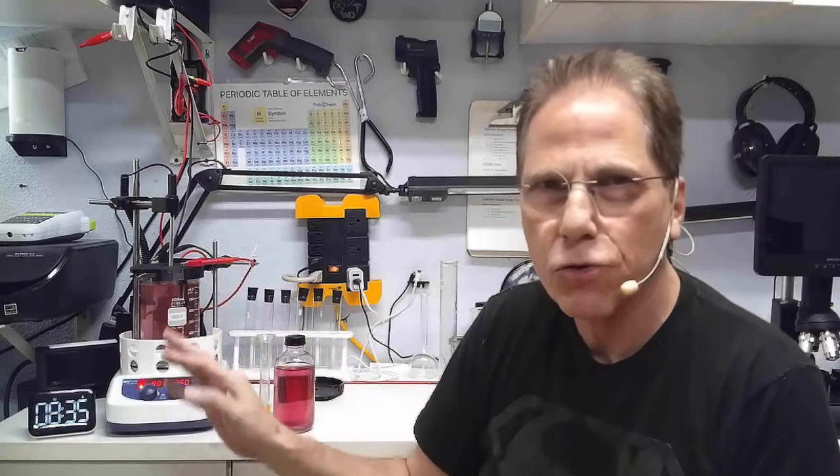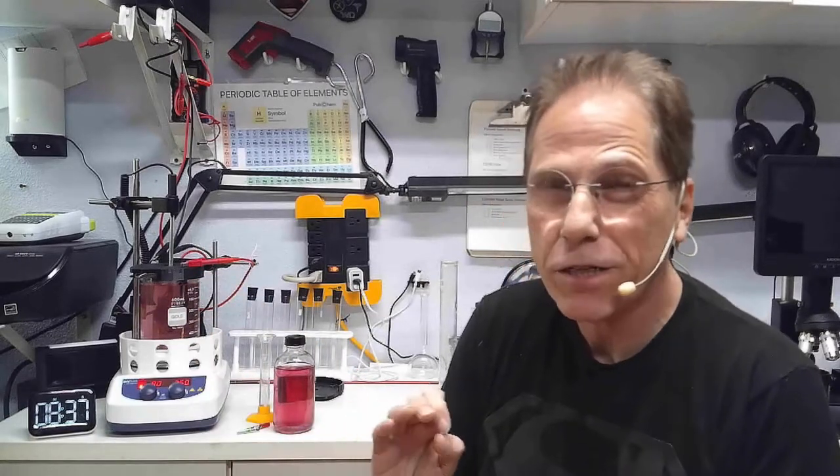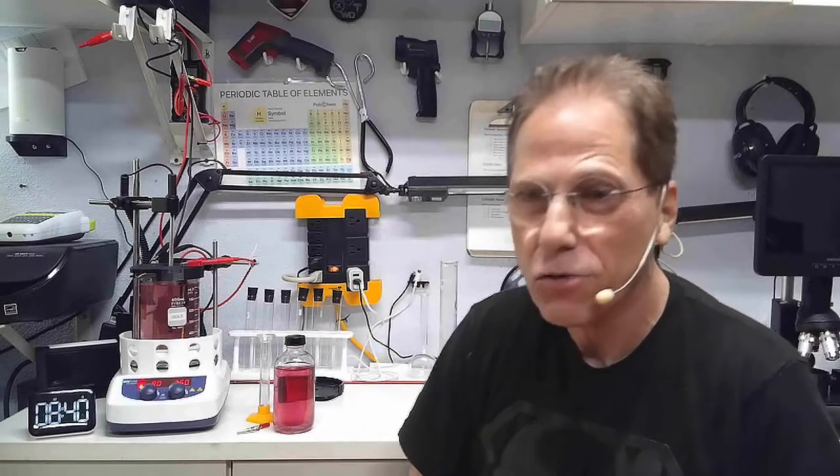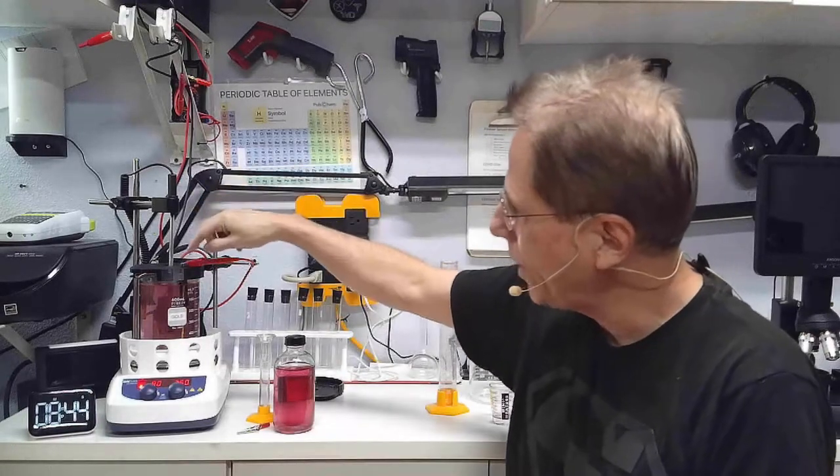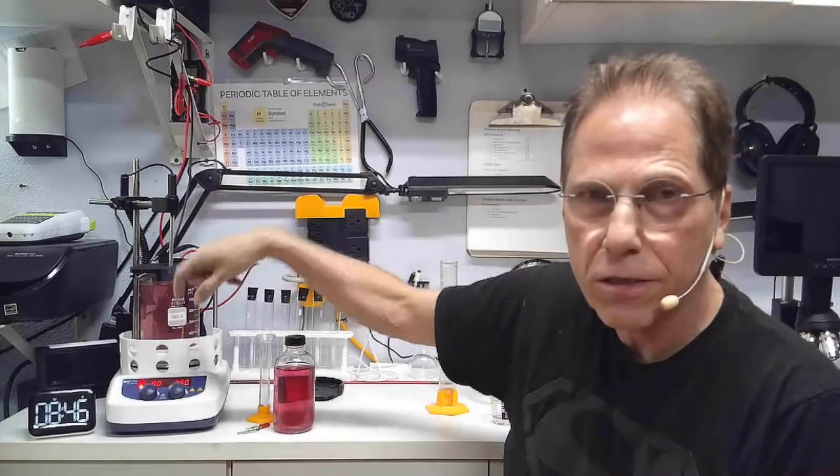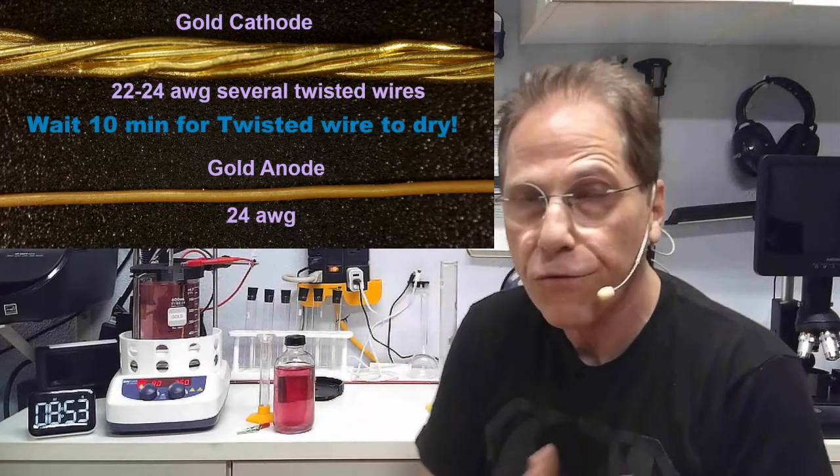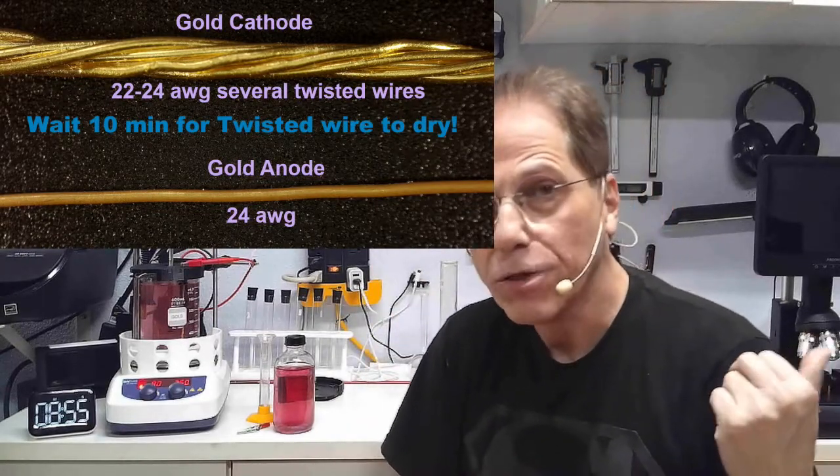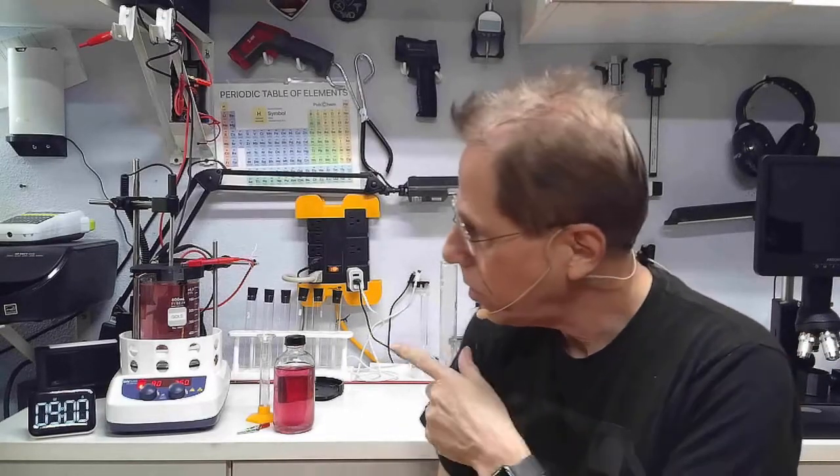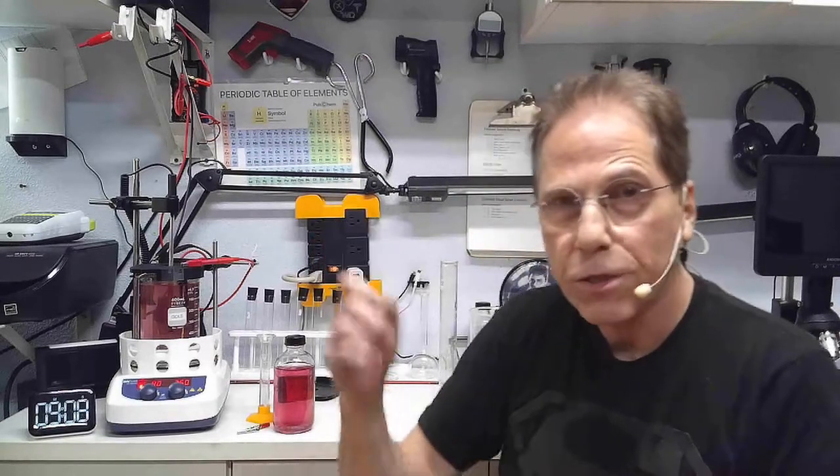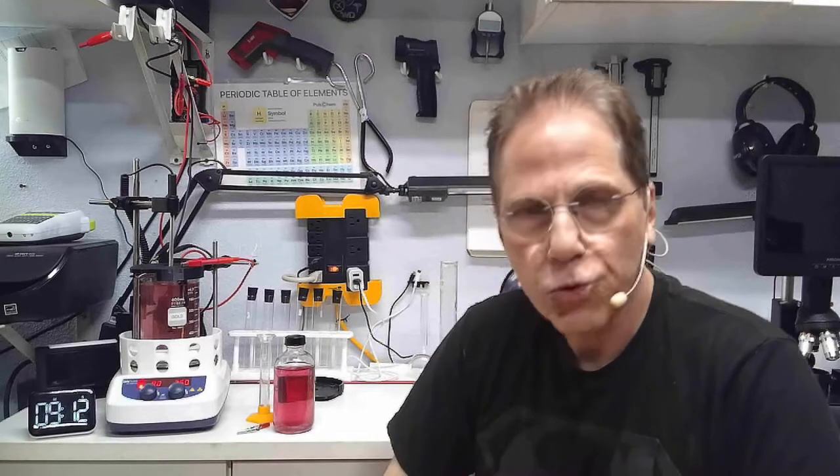Keep in mind, if you're using twisted gold wire, you have to wait for the water to dry out in between the twisted gold wire before you're going to get an accurate weight measurement. They will always weigh heavier with the water in between the twisted gold wire. You need to let it dry up before you can get an accurate measurement.